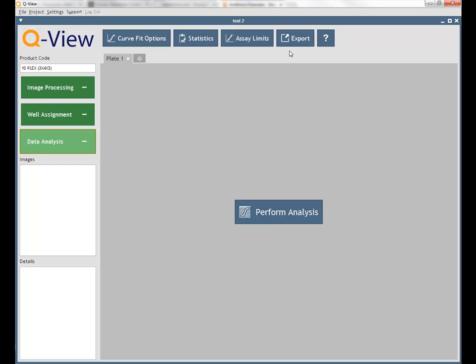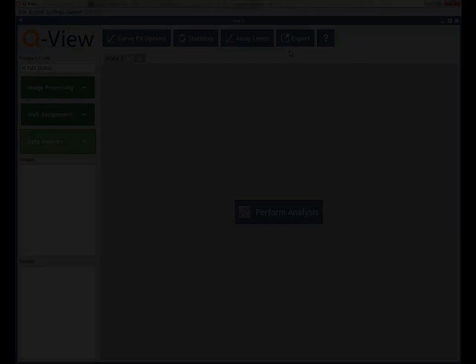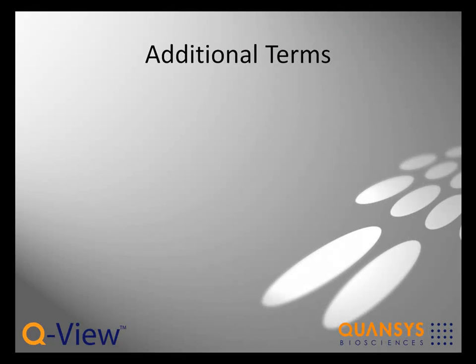QView stores the images and analyses of related plates together in a single folder called a project that has a .QView extension. As you work, changes to these projects are saved automatically.